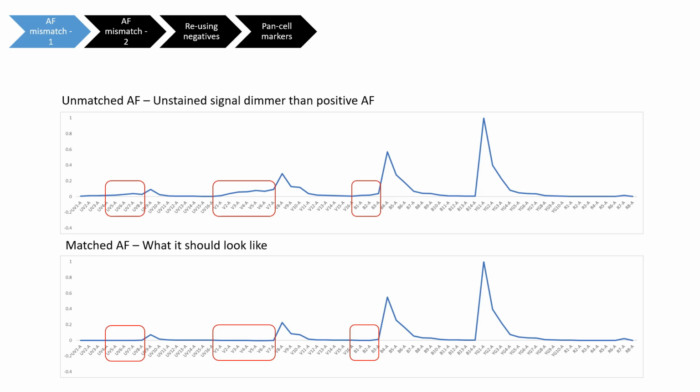If we use this as our reference, we would expect there to be an overestimation of the contribution of PE into the early violet region, and thus it will apply more compensation than is needed against fluorochromes also emitting in these regions.